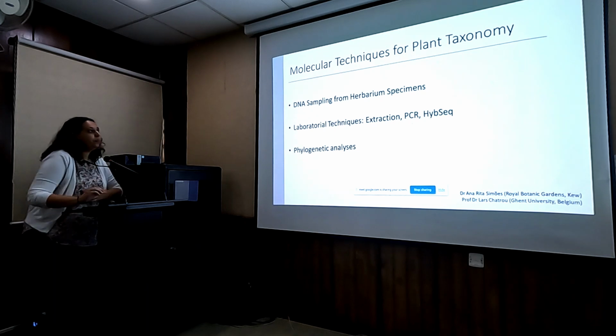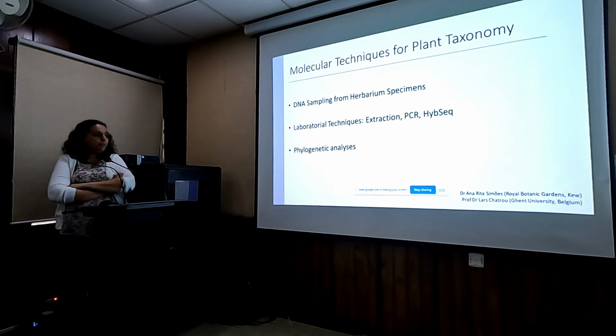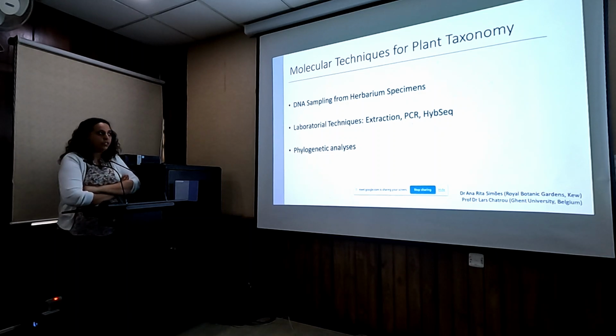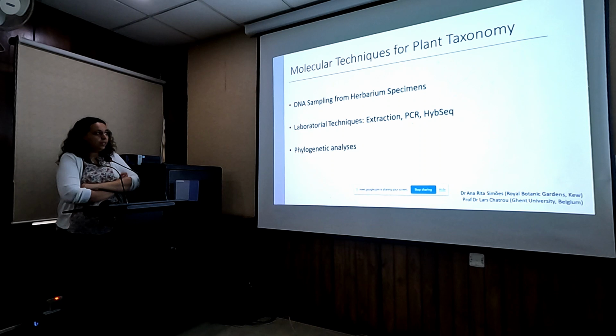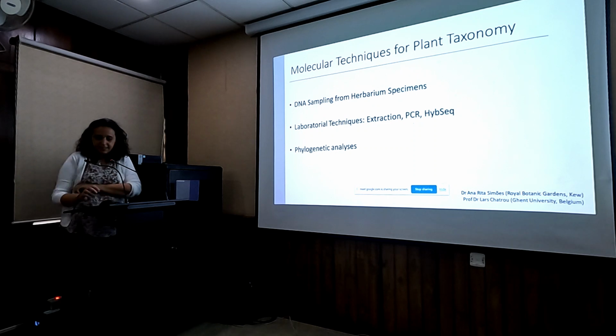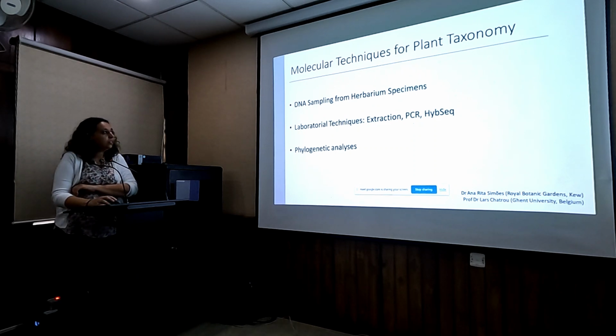So we'll start by talking a little bit about DNA sampling, things to think about when you're using herbarium specimens or your collections for molecular work, an overview of the laboratory techniques, and in the end, the phylogenetic analysis when Lars will join.